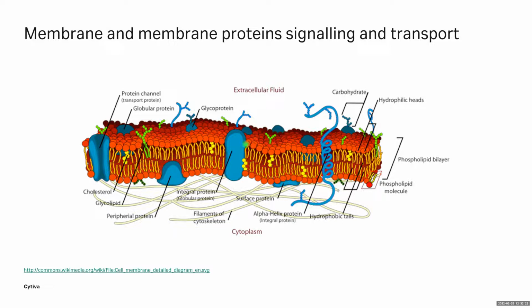If you keep them in the membrane environment without some purification, then you're going to have a relatively low density of targets. And yet about 20% of total proteins are somehow membrane associated, either by passing fully embedded into the membrane or being associated at either the cytoplasmic or the extracellular side. And I think the number is that about 50% of known druggable targets happen to be membrane, transmembrane, or membrane-associated proteins. So they are a very important class of proteins from a pharmaceutical standpoint.